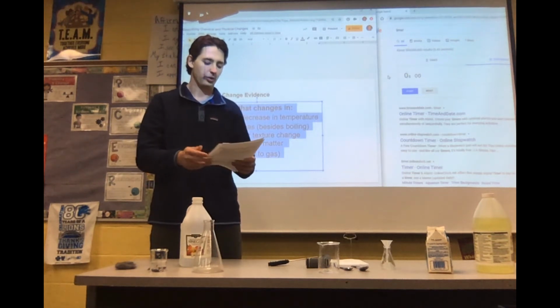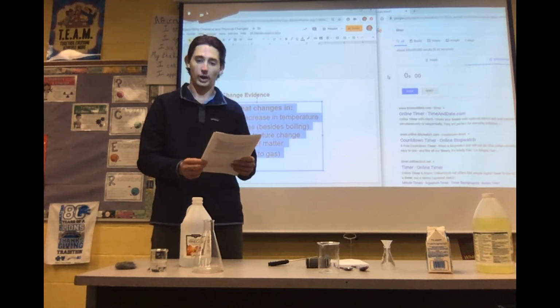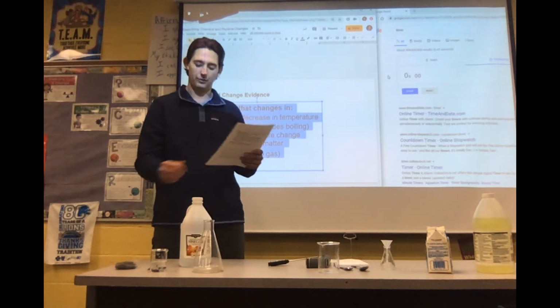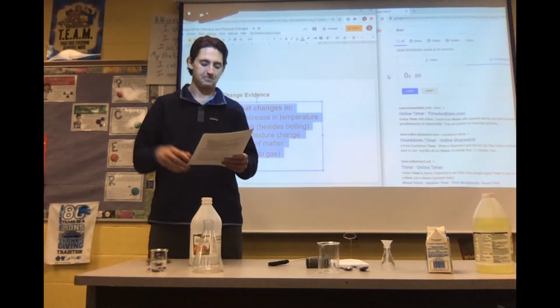Read through the essential question: how can I collect and organize data to determine if a reaction is endothermic or exothermic. Make sure you read the introduction. Instructions: 1. View the data table below that will help you collect and organize the temperature and observations of a chemical change throughout the experiment. You're going to do it before mixing the vinegar and the wool, during the reaction, and 5 minutes after mixing. All right. Watch the video.